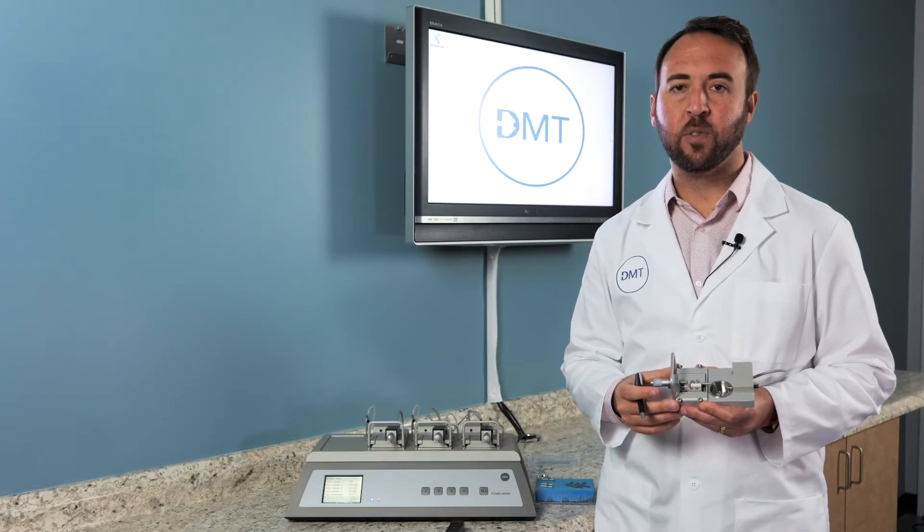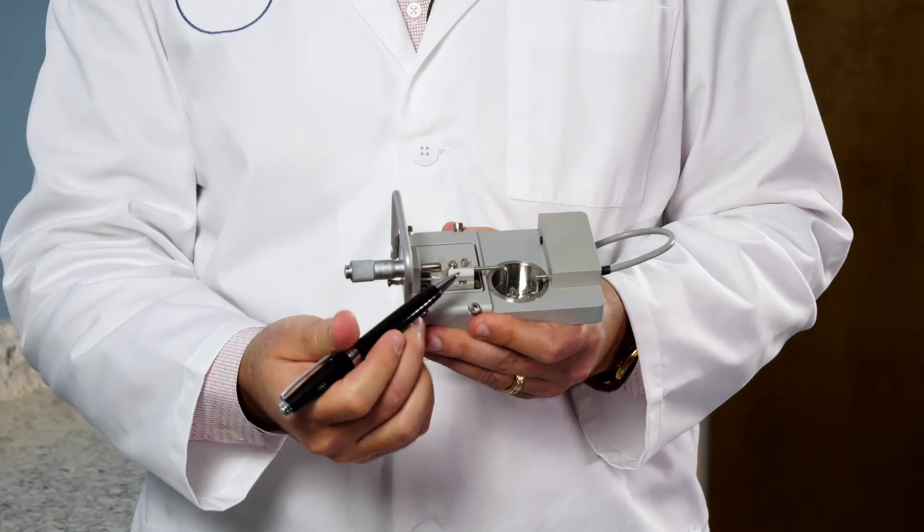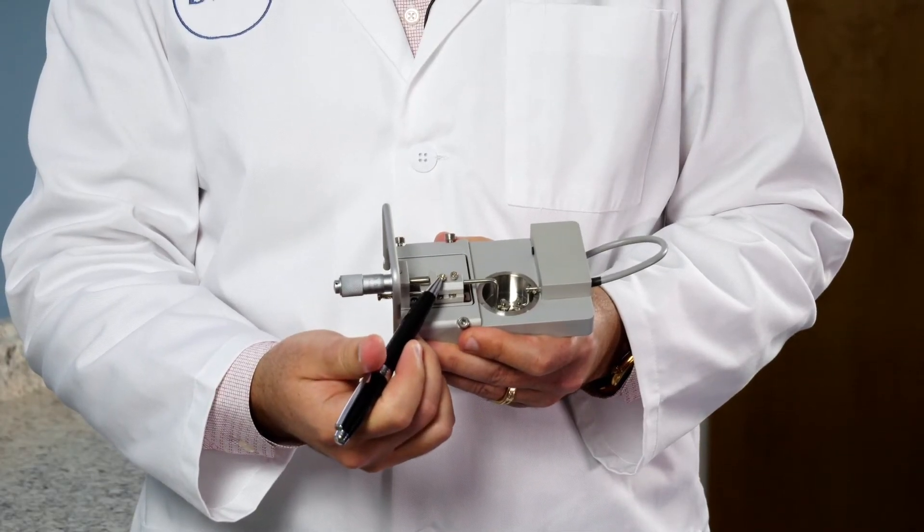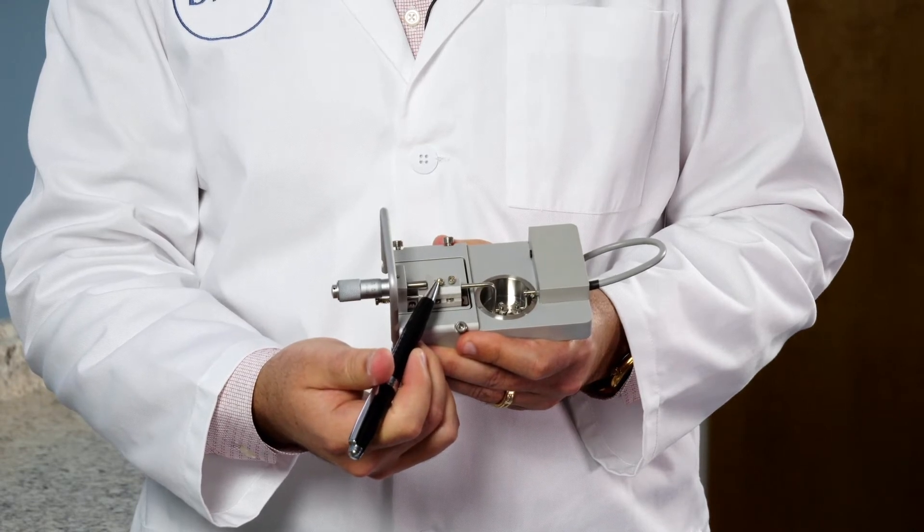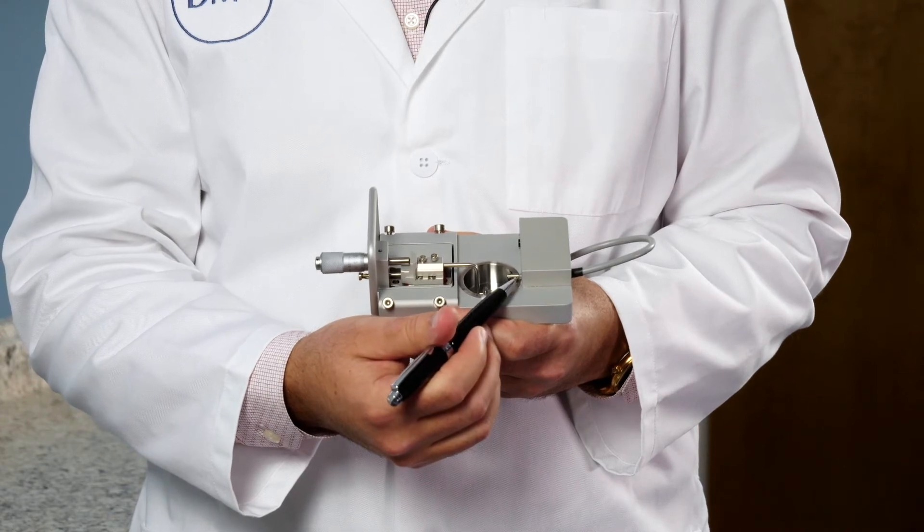When aligning your mounts, you have two types of adjustments: coarse and fine adjustments. For the coarse adjustments, you can loosen the back screw on the micrometer side or the back screw on the transducer side.